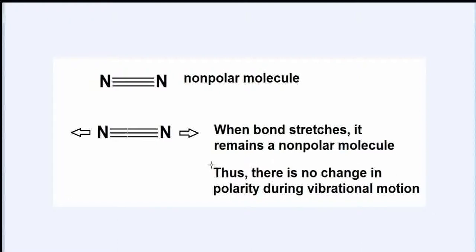And that's very important. If a vibrating bond changes its polarity, it can absorb an IR photon. We say that that vibrating bond is IR active. If a given bond in a molecule, given its vibration, does not undergo a change in polarity, no change in dipole moment, we say that it is IR inactive. It cannot absorb an IR photon, even if there's a match in frequency between the photon and the vibrating bond.